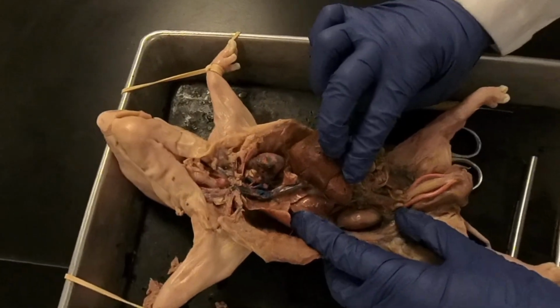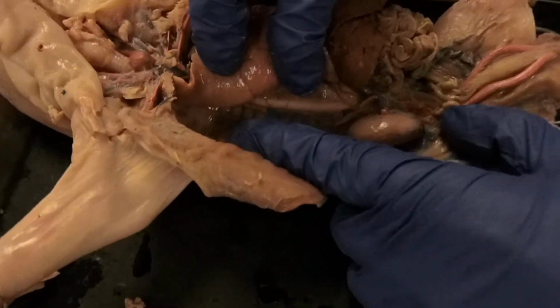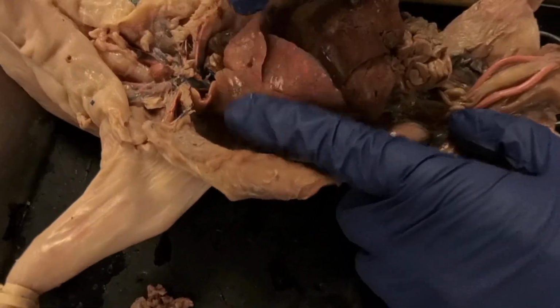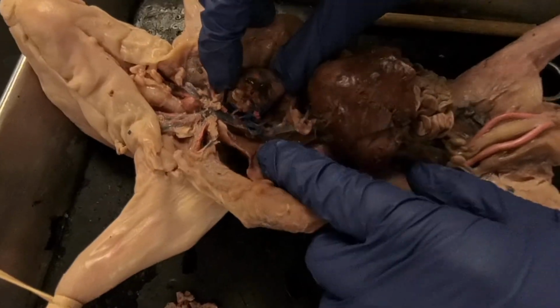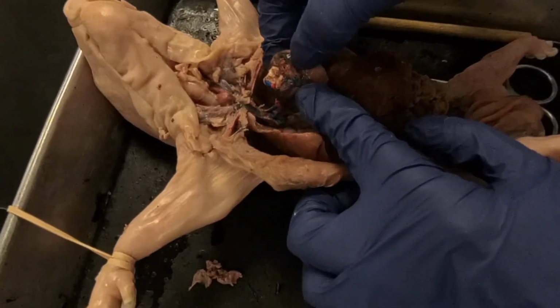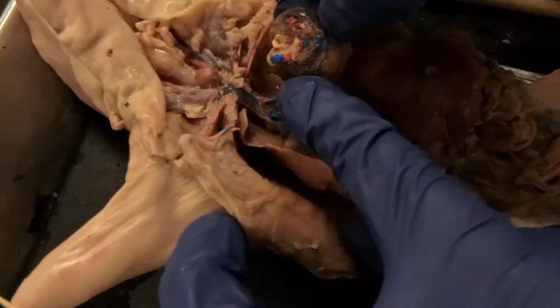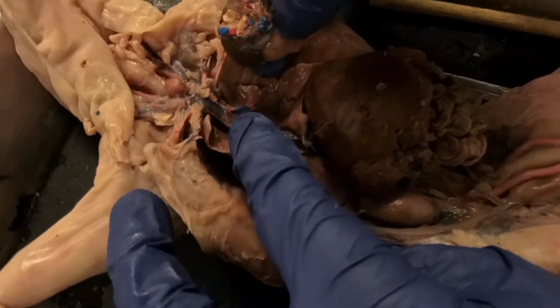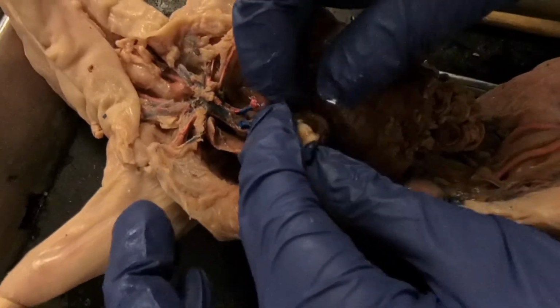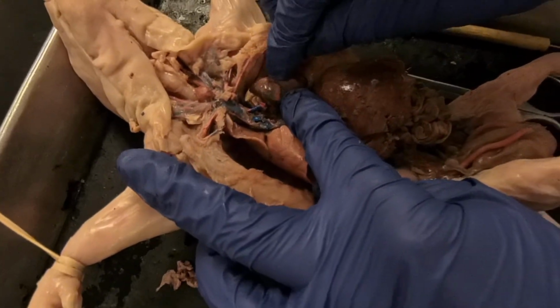Here is the umbilical vein. It connects to the posterior vena cava. I have the heart out, so I can kind of try to see where it connects, like right here, because we avoided cutting that area, but most of the time we just cut through all of those. It's hard to see where it connects, but it connects right there.